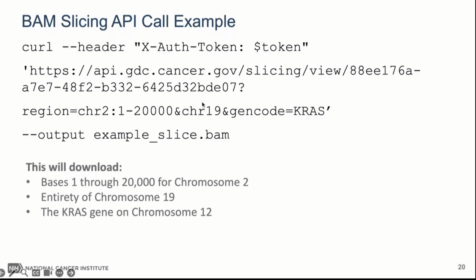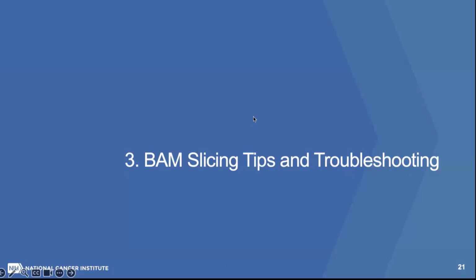Usually we would do live demos, but because of the sensitivity of the data, we are not doing that here. So lastly, I want to talk about some BAM slicing tips and troubleshooting.